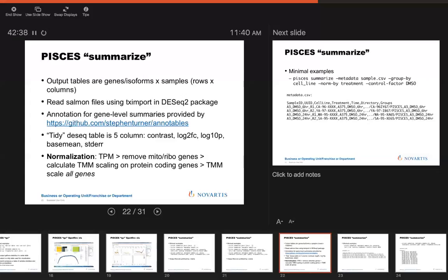And if we're sequencing from, say, PBMCs or whole blood, you end up having hemolysis in your samples sometimes. So if I have those sample types, I will also pass in a list of genes like hemoglobin that are sometimes highly abundant in those specific samples and exclude those from normalization. So normalization is not easy, and it's not the same for every sample.